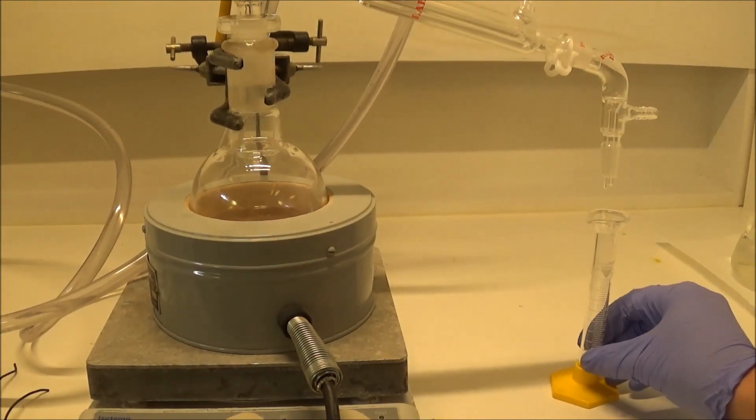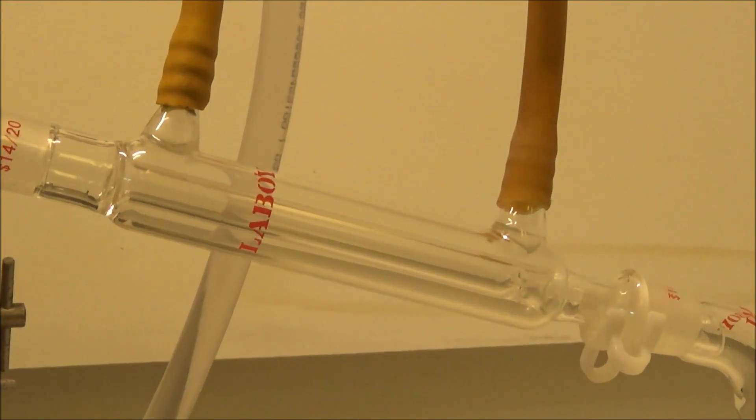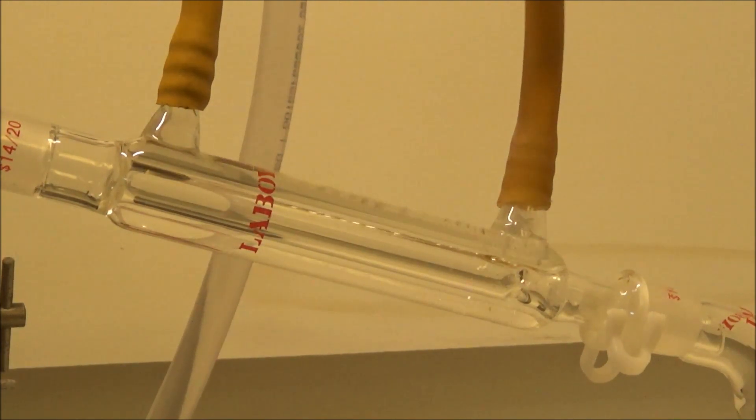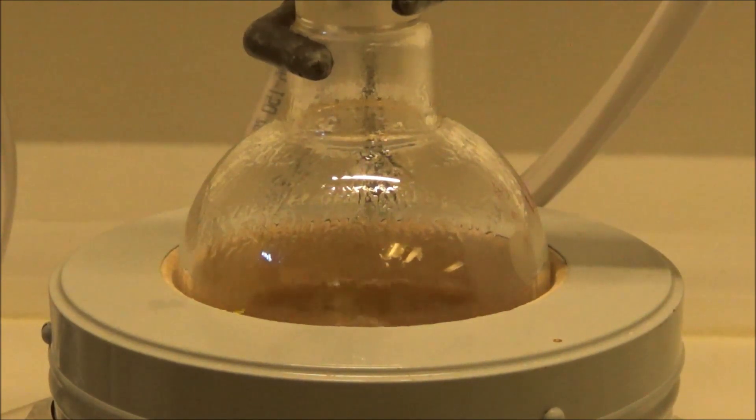I opted for a simple distillation because a column would be very slow with the high distillation temperature, and I didn't have an accurate vacuum gauge for vacuum distillation. 1,3-dibromopropane boils at 167 degrees, so I insulated everything well with aluminum foil.